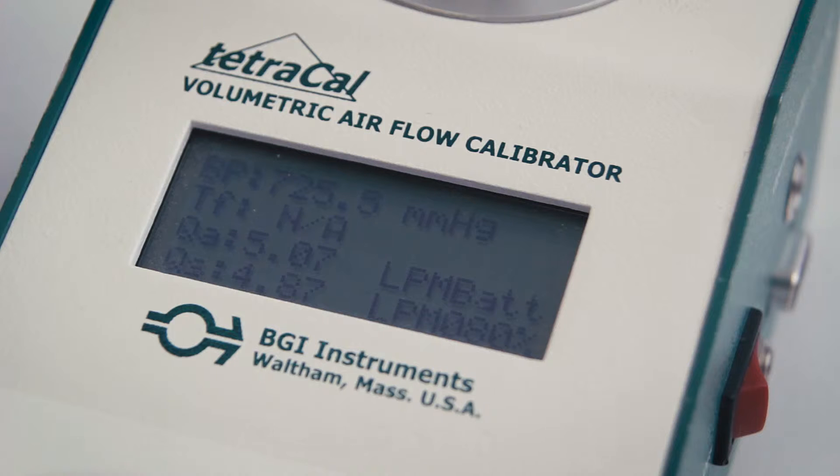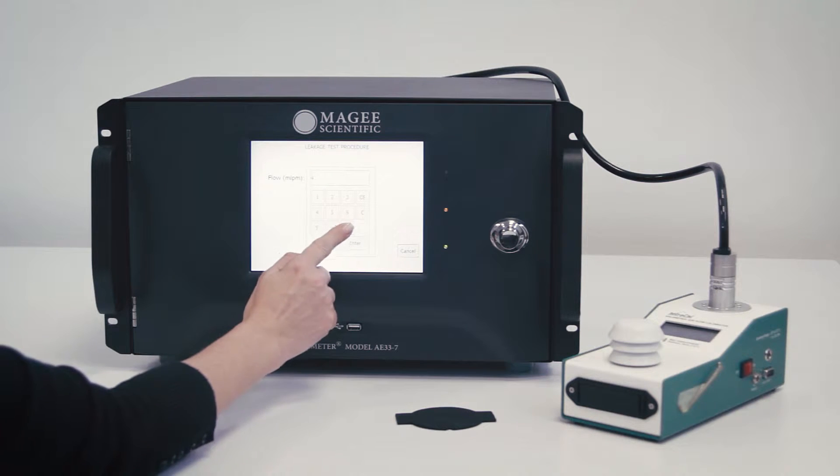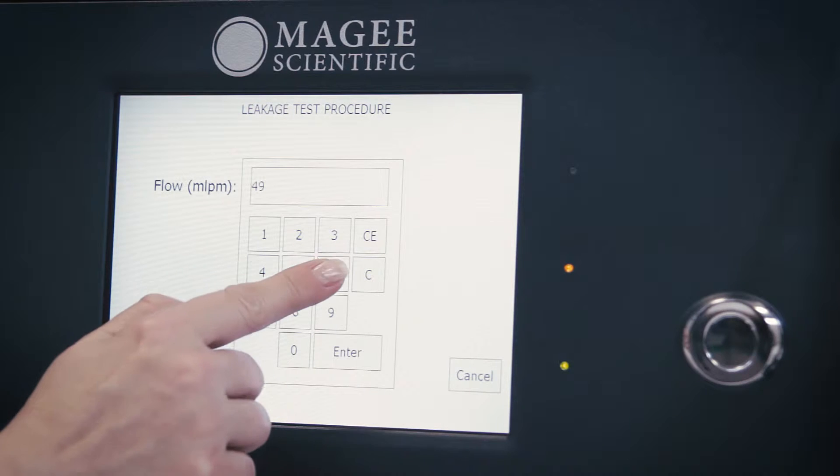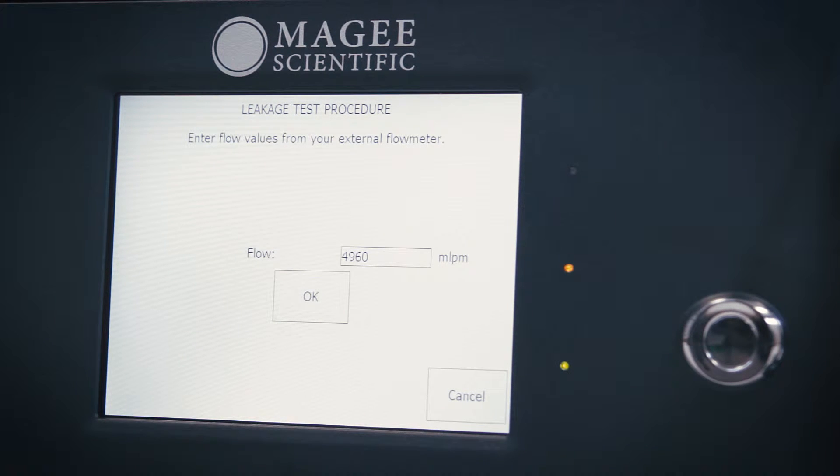Observe the flow measured by your flow meter. Make sure that your flow readings are reported at standard conditions. Press the input box field and enter the flow from the external flow meter. Units are milliliters per minute. Confirm by pressing OK.